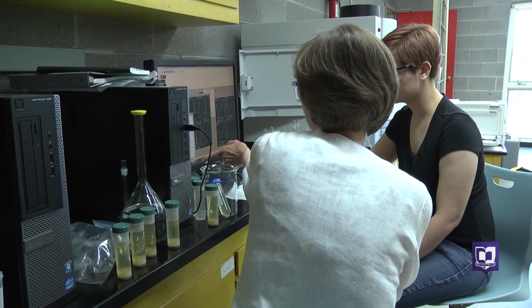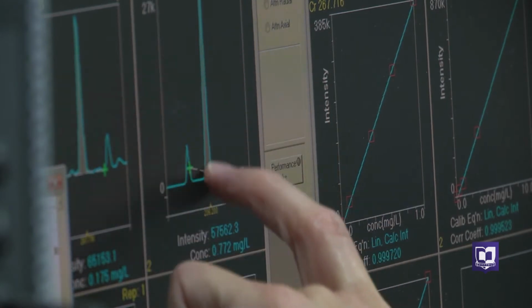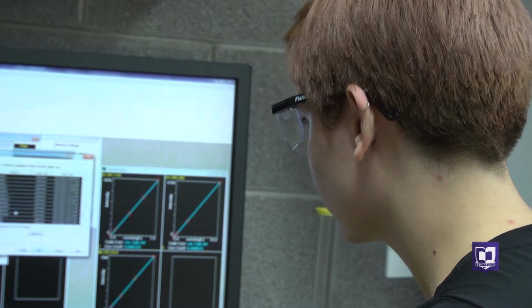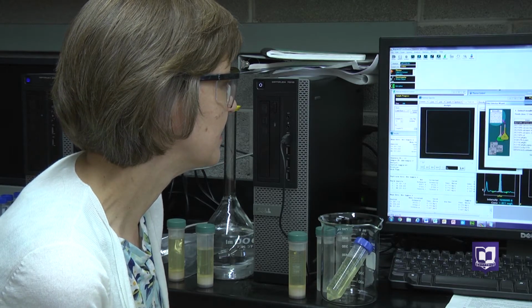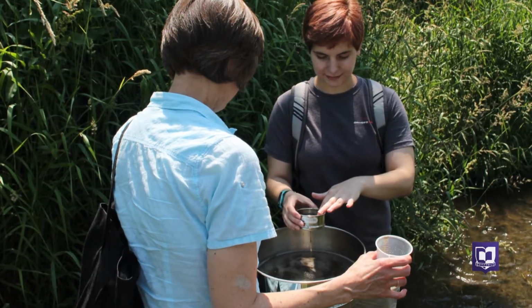A Cornell College student and a chemistry professor are gathering data on two topics: an ancient Iowa culture and lead levels in soil. Senior Lizzy Davidson and Professor Cynthia Strong are working together on both projects over the summer. The soil samples come from a small tributary near Mount Vernon called Indian Creek.